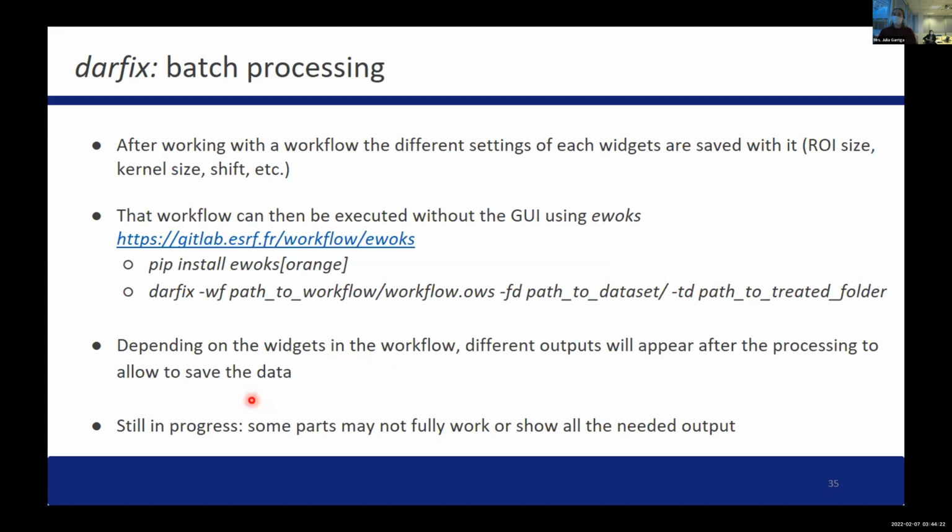And finally, we have, since not a long time, implemented batch processing, which allows you to do, for now, via the terminal. It allows you to execute the same workflow you've previously created with Orange, but automatically. So basically, if you have saved the workflow and saved certain parameters, it will run with any data set you want it to run without the need to start in the GUI. This part is still in progress. We have some bugs that need to be fixed, but it can already be used.